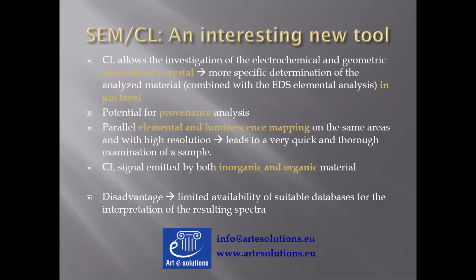Obviously, in order to do this technique, I forgot to mention that we can have a sample prepared in the same way that we would prepare it for SEM analysis. Especially when we're talking about materials like painting layers, the biggest advantage is the fact that we can tackle both organic and inorganic material at the same time with the same technique.